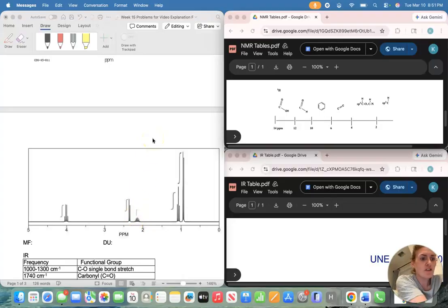All right, so now we're going to look at our hydrogen spectra. And we're going to see 5 shifts. We're going to be looking at the integration, multiplicity, and what those indicate. So the first one we'll talk about is this 4.1, where you'll see 4 peaks here, and those are going to indicate that it's a quartet. If we go down the line, we're going to see that we have a 2.3, which will be a doublet. This 2.1 will be a multiplet, 1.2 a triplet, and then this 0.9 is going to be a doublet.